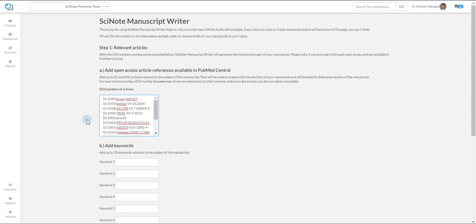In the next step, you can add up to 10 keywords relevant to the subject of the manuscript.